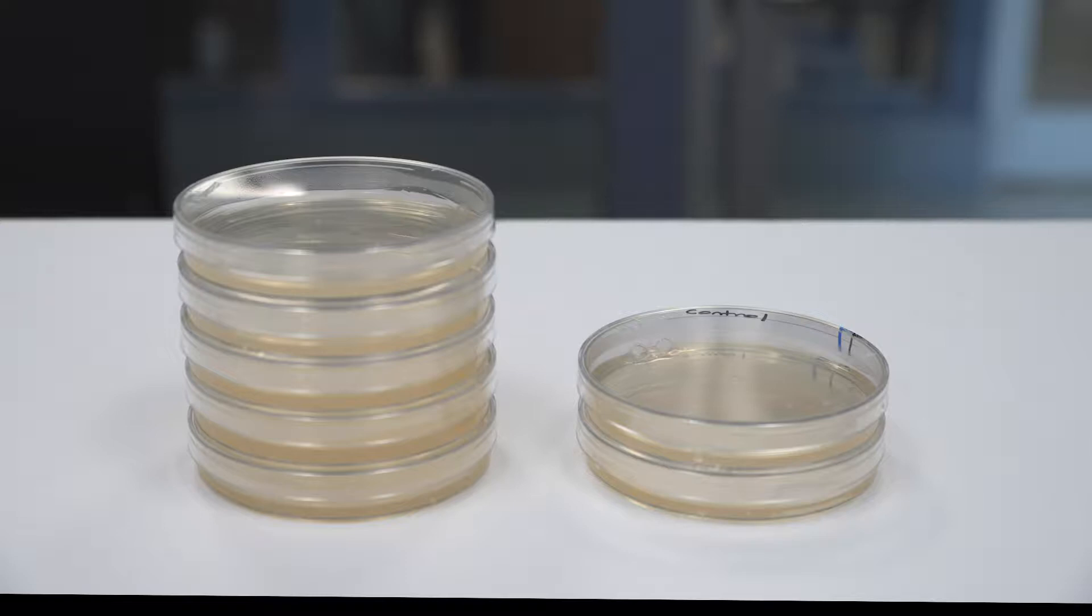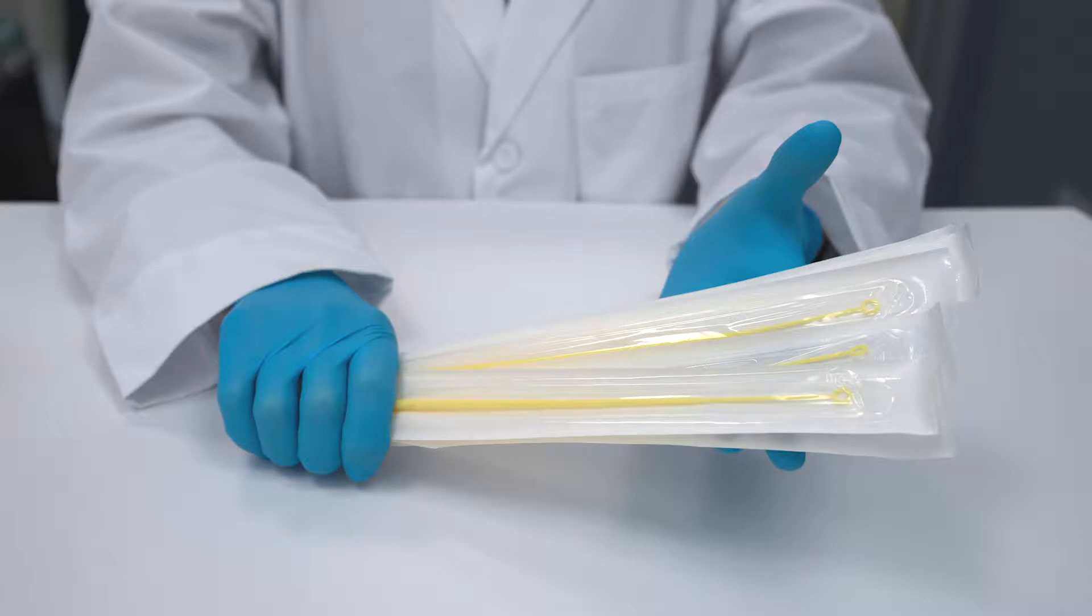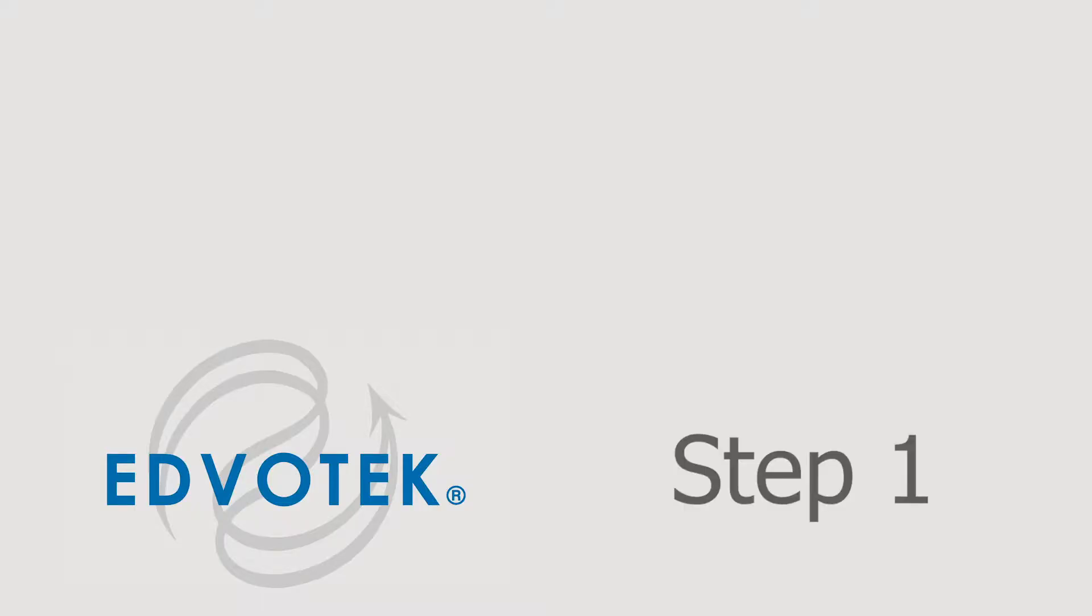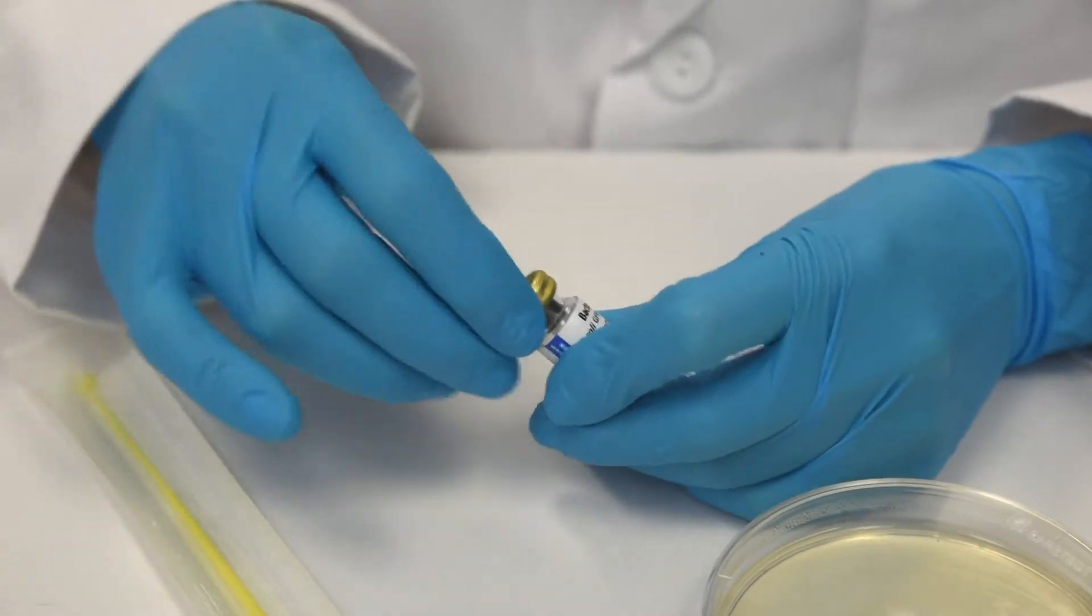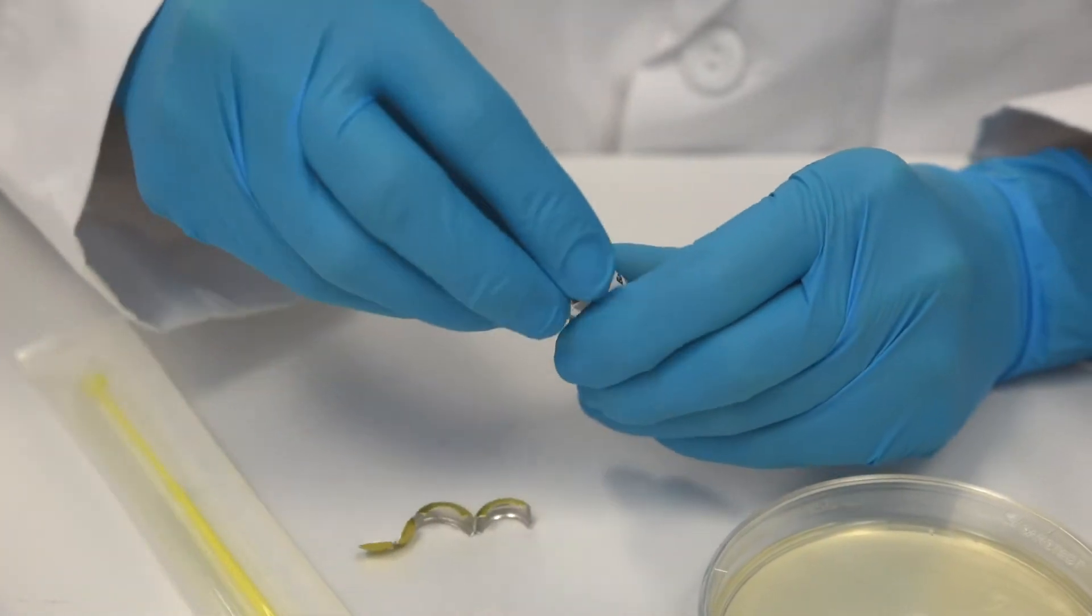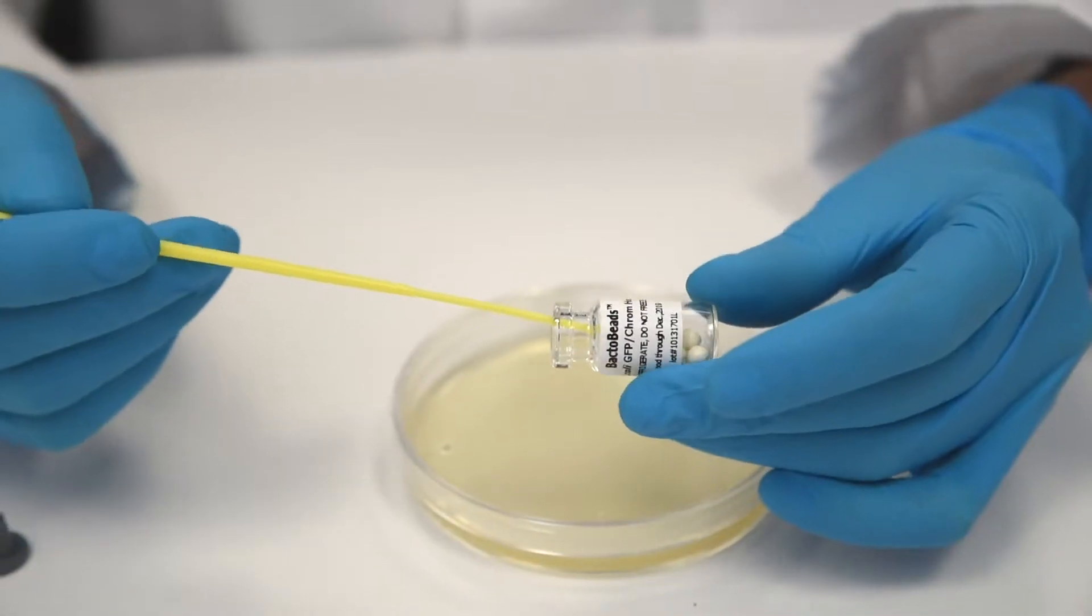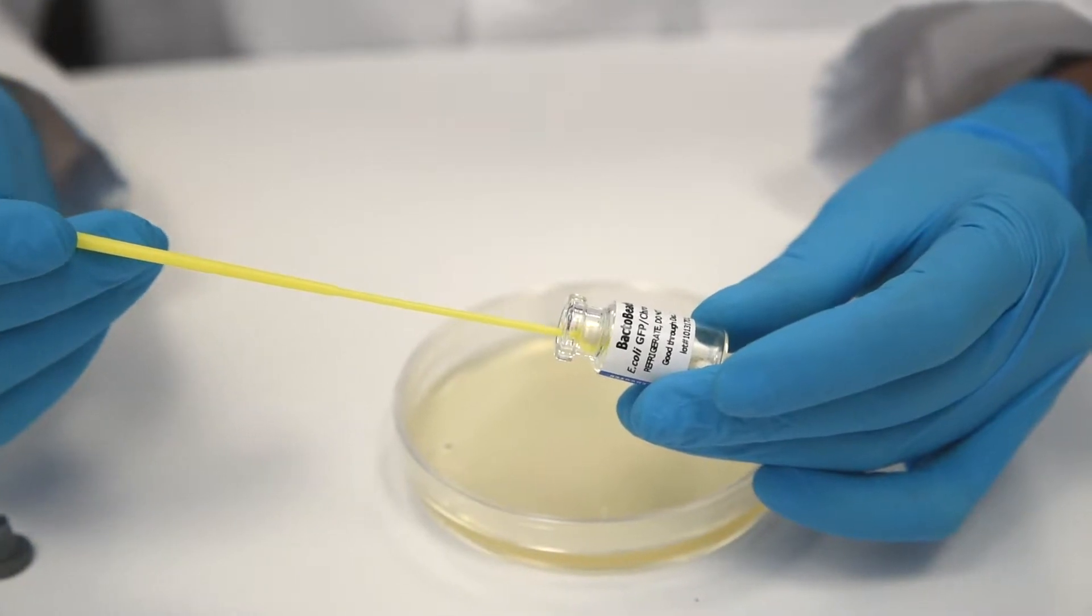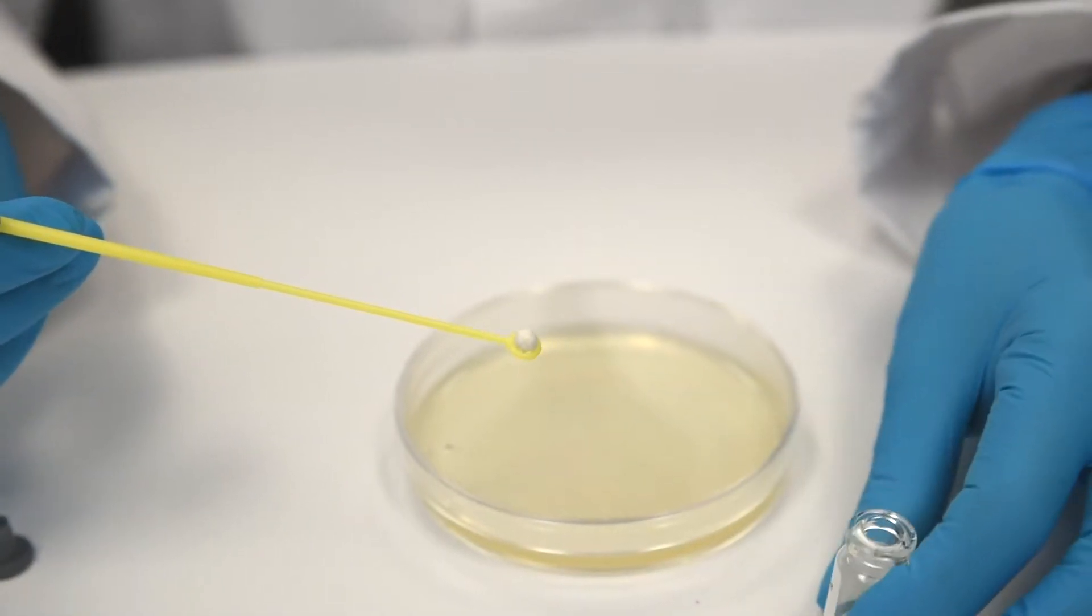You'll also need Sterile Inoculation Loops and Recovery Broth. Step 1: Remove a single Bacto Bead from the E. coli GFP Host vial using a sterile inoculation loop. Using aseptic technique, transfer the bead to the edge of one of the large LB source plates and replace the lid.